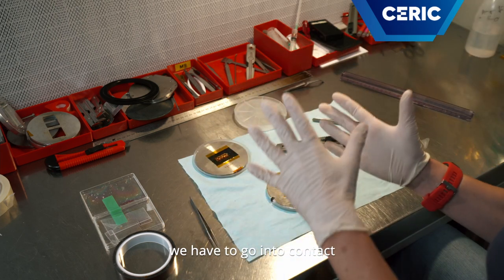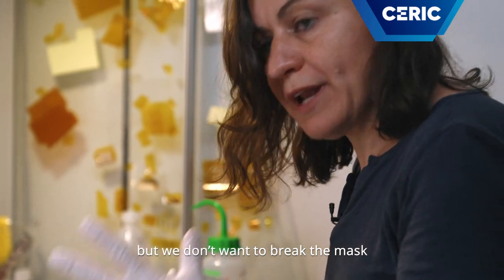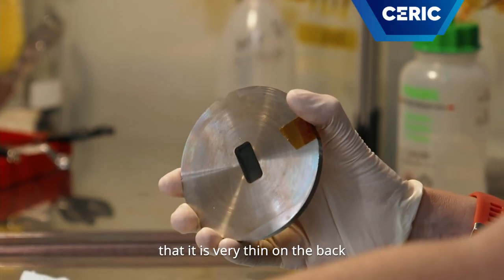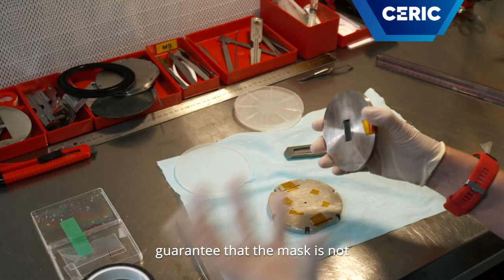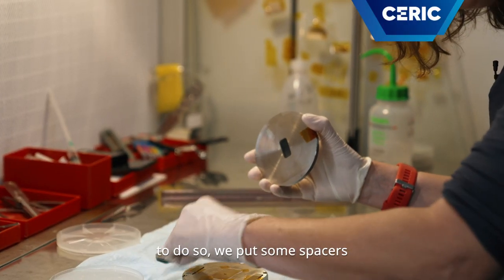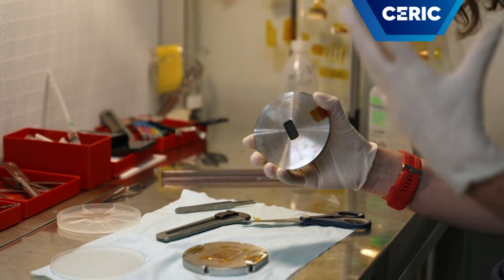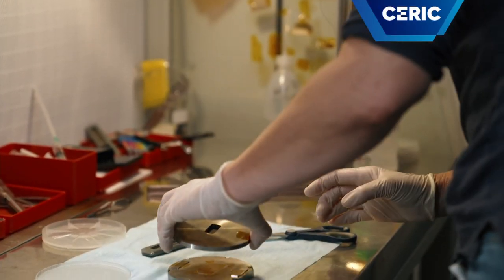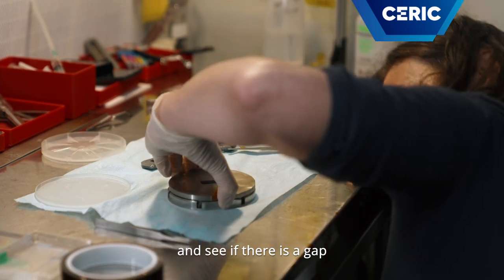Then we have to go into contact between the mask and the sample. But we don't want to break the mask, because you can see that it is very thin in the back. So we have to guarantee that the mask is not touching the sample. To do so, we put some spacers on the sample holder and then we check if they are placed correctly.